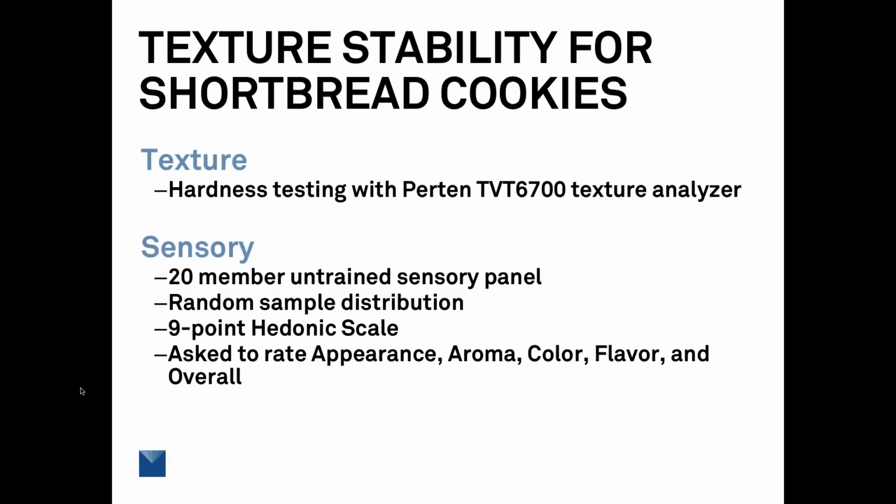Okay, so moving on with our shortbread. If we weren't able to track the chemical stability, what was our other choice for looking at the end of shelf life? The other thing was texture, which is what we thought we would be interested in.